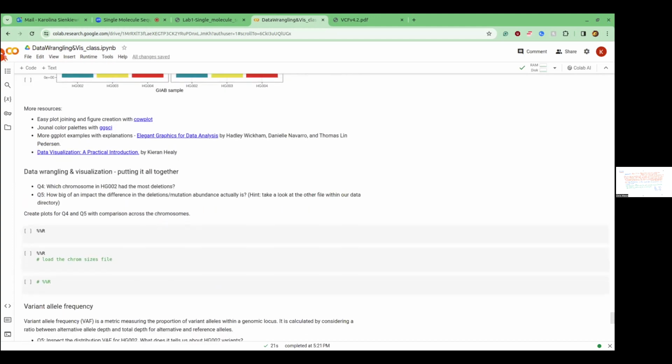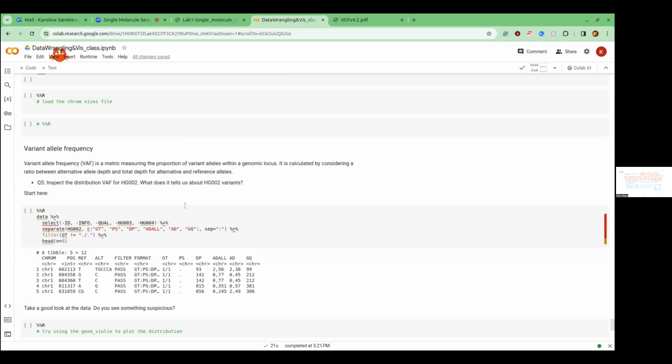All right, I know I'm going over the time. I will just do a last thought regarding VCFs. Usually, when you get your VCF, you will have different ways to evaluate it. One of them would be just taking a look at the filter field, but this is very basic.